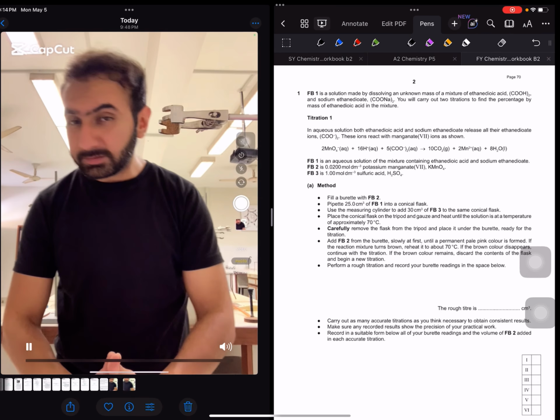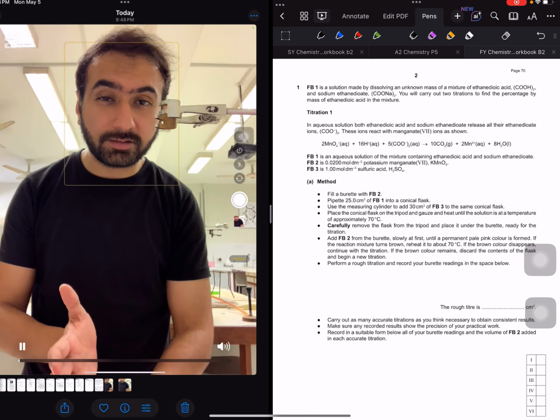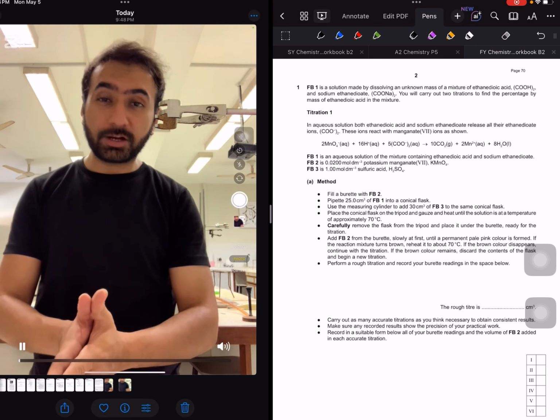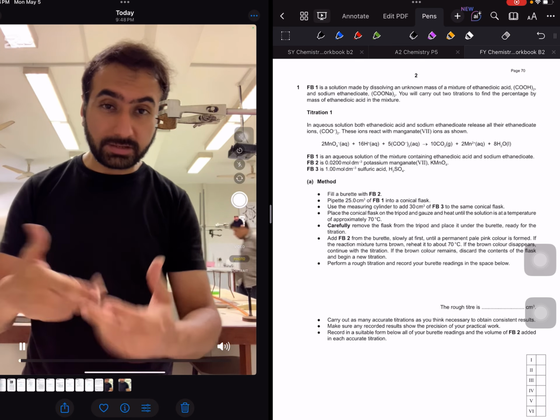So guys, we'll be performing this practical today, which belongs to 2017 October November. We are selecting this because it has a different kind of titration, a different kind of acid, and obviously at the same time the qualitative analysis is also a little different.